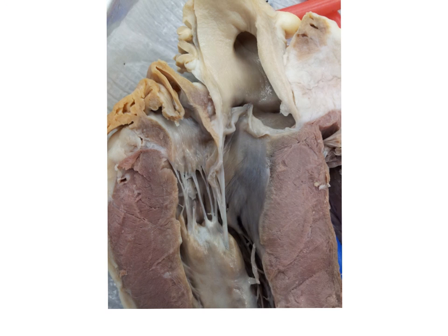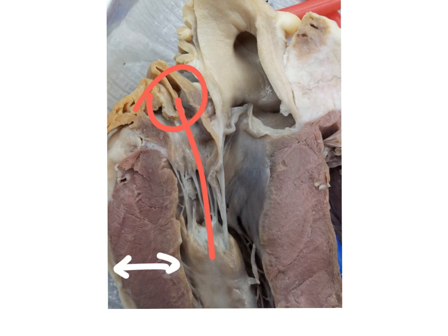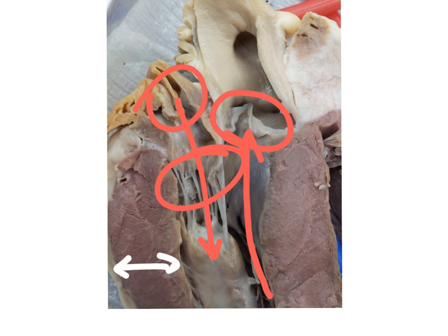Here's a nice section of the left side of the heart showing the valves. We know this is the left side because of the thick myocardium. The oxygenated blood coming back from the lungs would be going from the left atria through the bicuspid or mitral valve, then going back up and out — and now you can nicely see right there is the semilunar valve leading to the aorta.